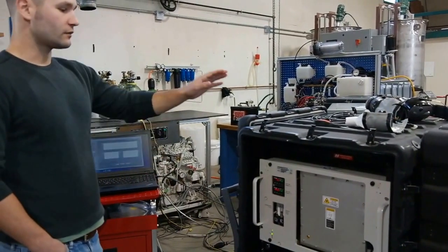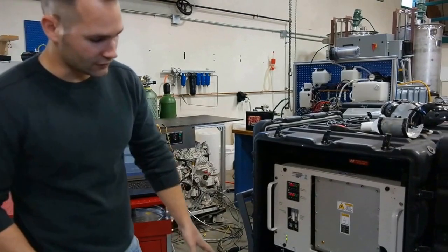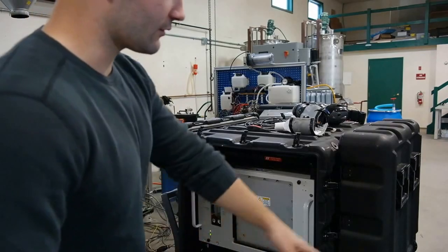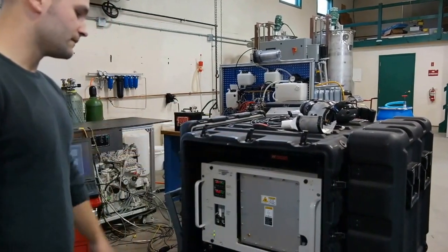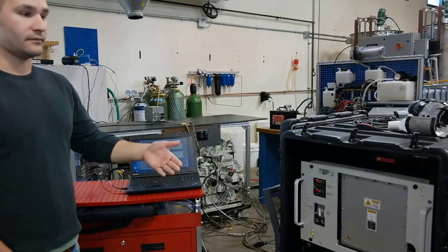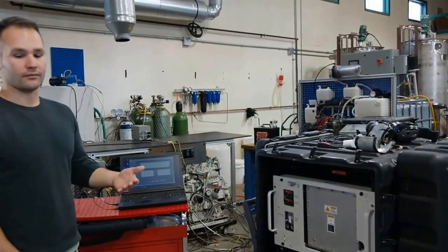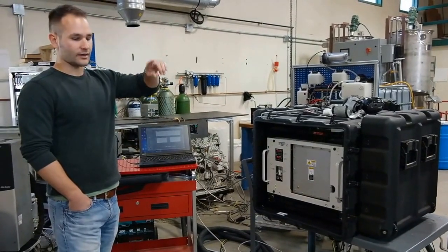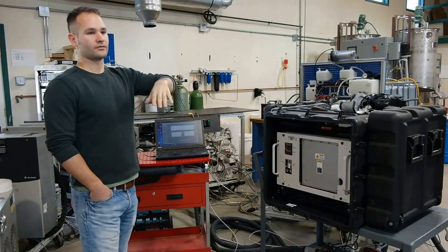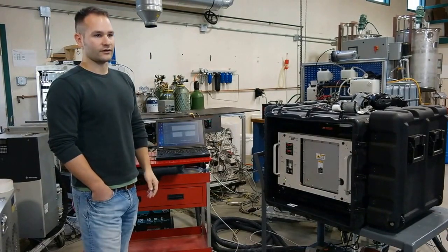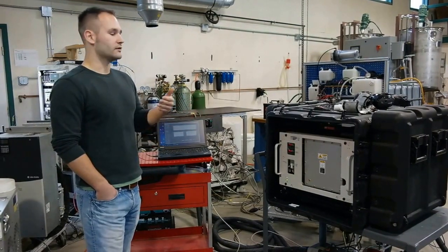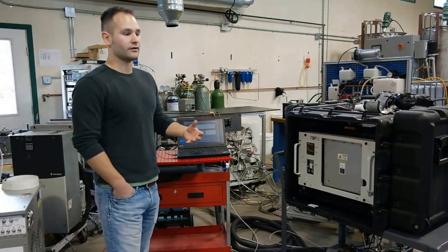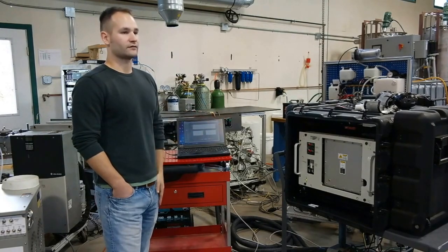This measures all of our gaseous emissions. We have a pump and filter system that basically pumps the exhaust sample through these lines into this instrument. Basically it looks at the infrared spectrum of the exhaust gases. From the various absorption peaks and troughs in that infrared spectrum, you can determine what species exist in that exhaust at what concentrations, depending on what that spectrum looks like.